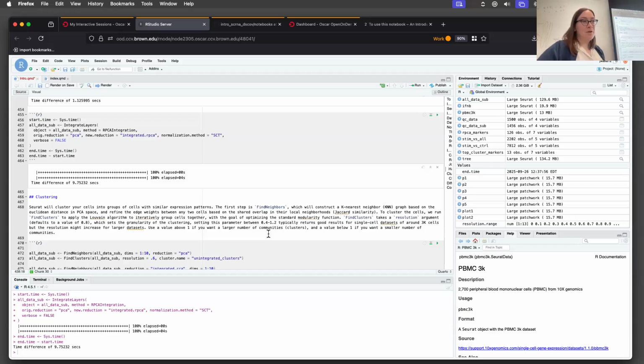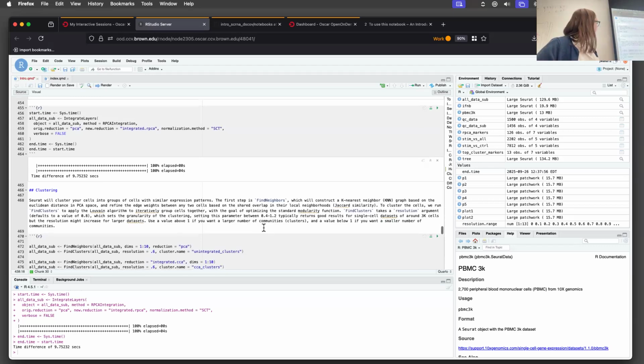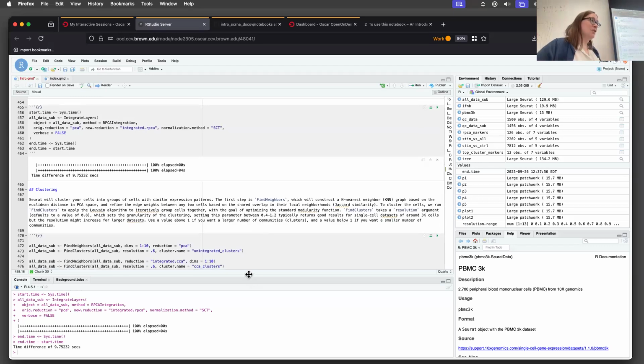I go into some other detail a little bit later about how you could QC your clustering. So maybe looking at the clusters could help figure out which integration method is best. I don't know. These are all excellent questions.